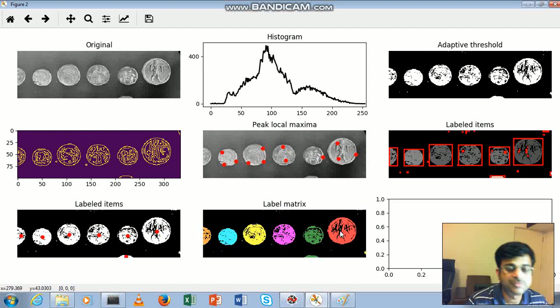Imagine if you had to do a similar exercise for a microscopic image that comprises cells, and you want each of the cells to get highlighted in a separate color so that whenever a technician is observing those cells through a microscope, he's easily able to recognize that these are the cells because they appear in different colors, and they can be distinguished very easily.